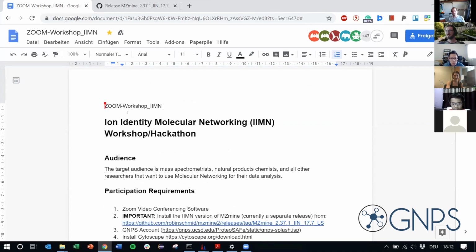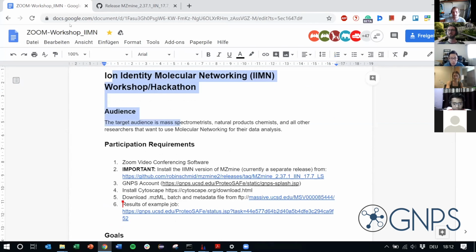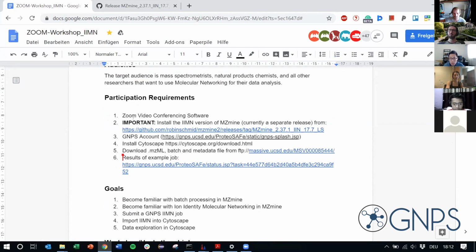Let's see. All right. I think you all must have been in this document here in the Google Docs, where you can see all the different steps that you had to do for the participation or for preparing yourself. And I just want to remind you, this workflow is currently only available in a special version of MZmine. We are currently working together with Tomasz Pluskal from MZmine to create MZmine 3. In this version, we will have the ion identity networking integrated, but it's a very big structural change.